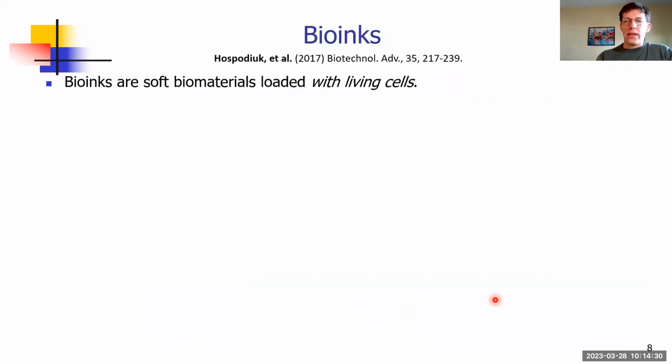The second step, as I said, is to create a bioink, and actually that's the big magic, the major part for a bioprinting group, to optimize the bioink. So it's pretty easy to design a nice model, and there are nice bioprinters commercially available, but the real magic thing, the real thing to work on is to produce good bioink.